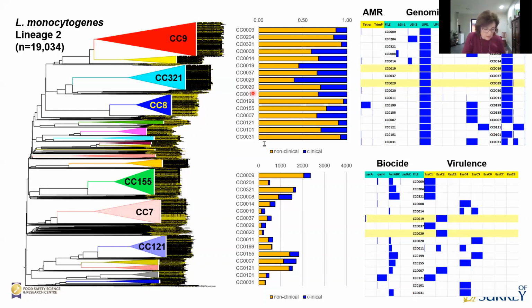I had one other question. You made the point about the reference strains being different. Do you think that problem is likely in other countries? Absolutely. It's a worldwide one. We just did it in the UK. I think some people have done it for Pseudomonas as well and found similar problems, that for the PA01 strain that everybody is using, there are very many different variants around. Campylobacter is probably worse in this because it's genetically very variable and unstable. But it means that even the E. coli that you're using for cloning may not be what you think it was at the time.